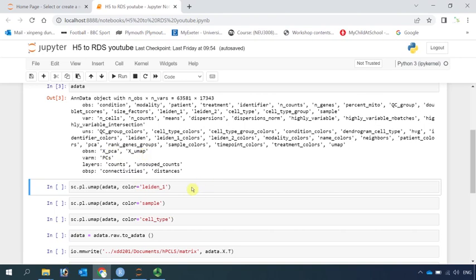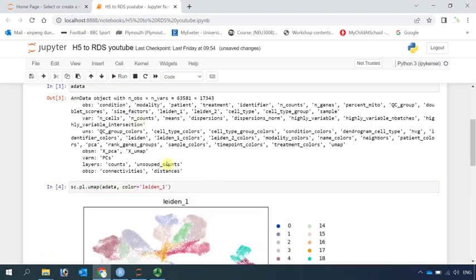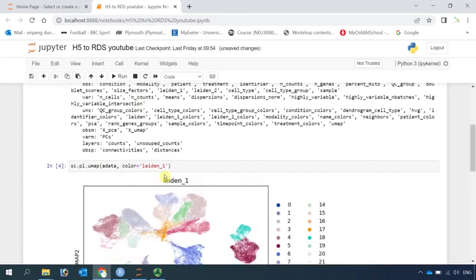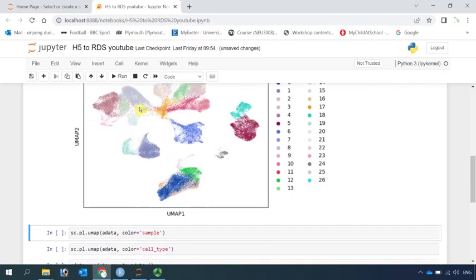So let's have a look at the cell clusters. We can use the information from the observations. This is the lower resolution. You can see there are 27 cell clusters in this dataset.